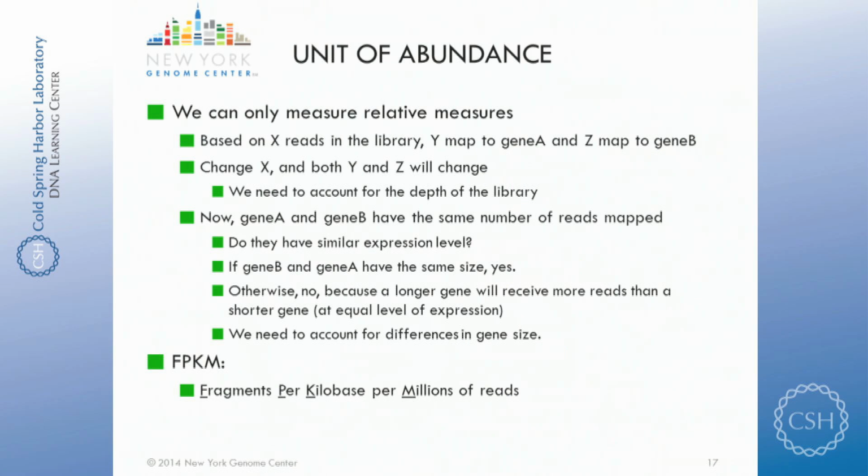So it will give you the quantification. Would that be based on, going back to what you were saying earlier, every transcript from one gene or individual? So it mostly works at the transcript level. Okay. So we'll try to quantify every isoform.